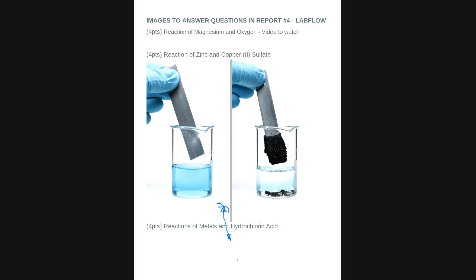And they are kind enough to give us the reaction. Basically, this reaction, you don't have to think about it. They are saying the zinc reacts with the copper sulfate to give you the precipitate of copper plus zinc sulfate. And this is the dark that you see.